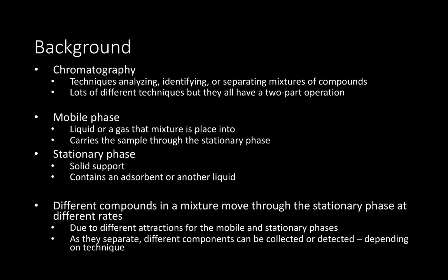So in general, chromatography is a broad umbrella term that describes techniques that involve analyzing, identifying, and separating mixtures of compounds. There's lots of different types of chromatography, and we'll discuss some of those, but they all have two parts involved in their operation. The mobile phase and the stationary phase are those two parts.